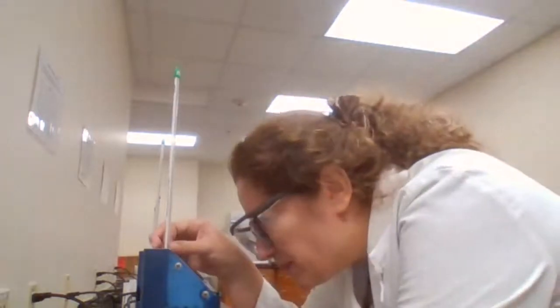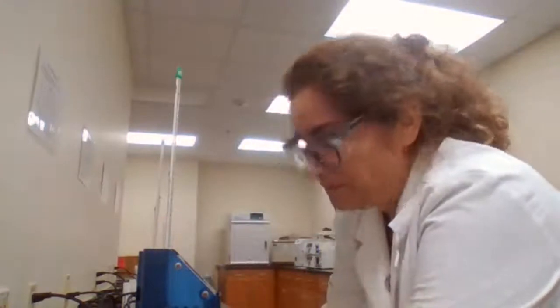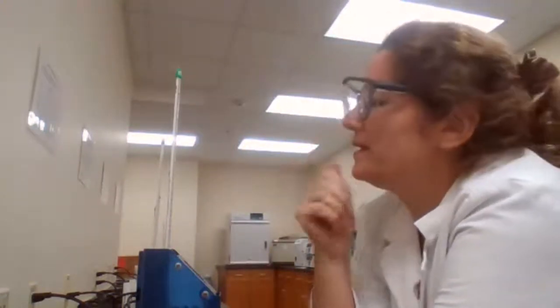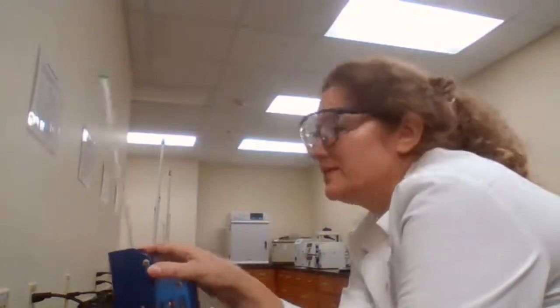Okay, the sample has not melted yet, and the temperature is 90-something, which is good news, because if it dissolves below 100, that means the sample is not dry.